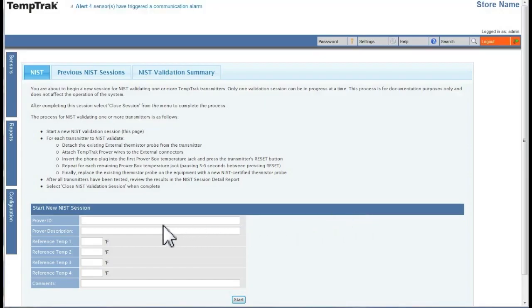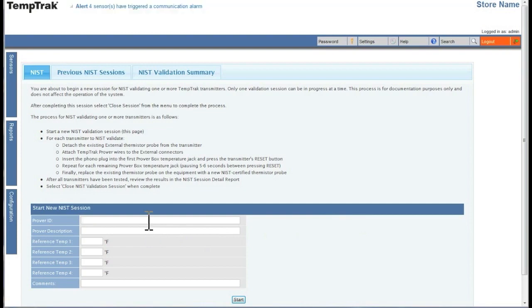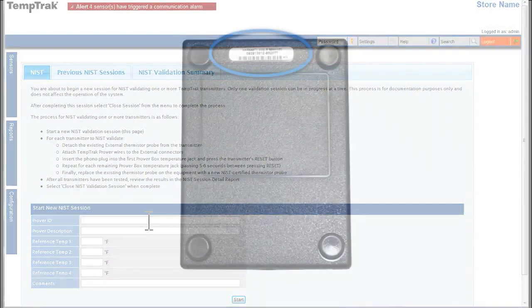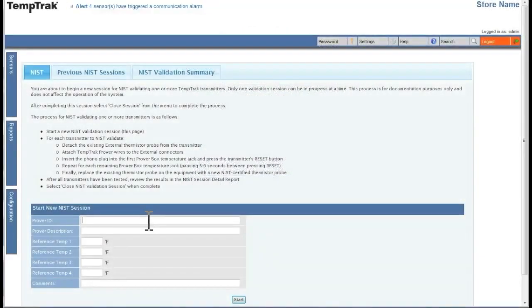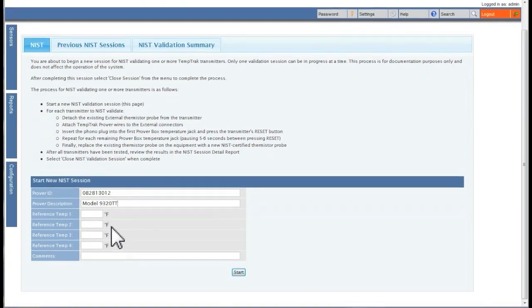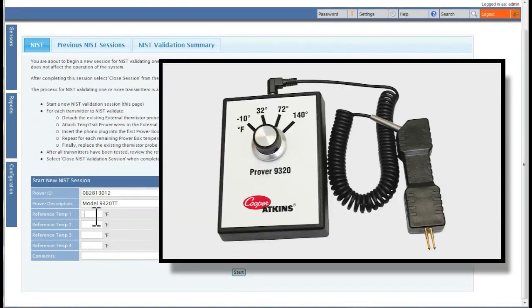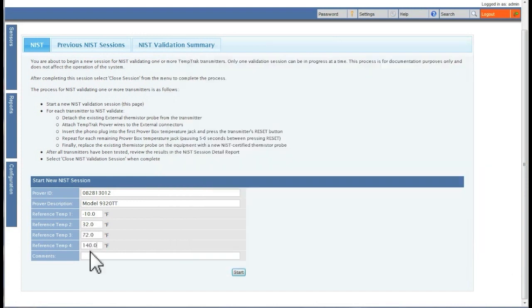To start a new NIST validation session, you will need to enter the Prover ID, which is located on the back of the Prover box. You can then enter a Prover description. The four reference values are the temperature values on the front of the Prover box. You will need to enter these in.